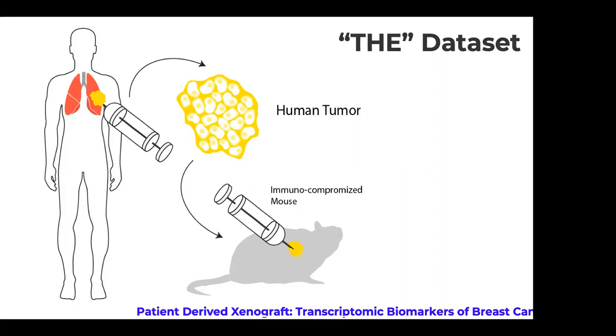In this publication, researchers investigated samples from 3 different types of breast cancers because they wanted to better understand and characterize tumors. That was the purpose.